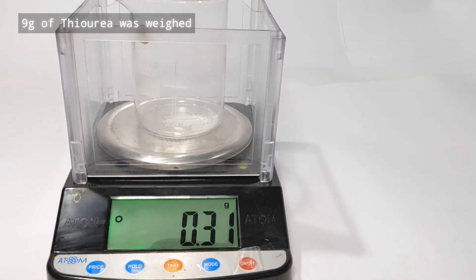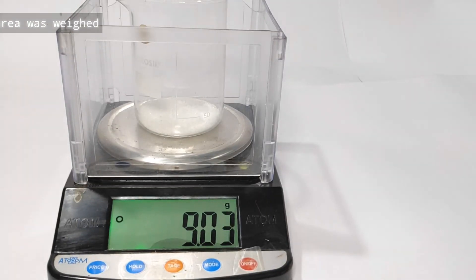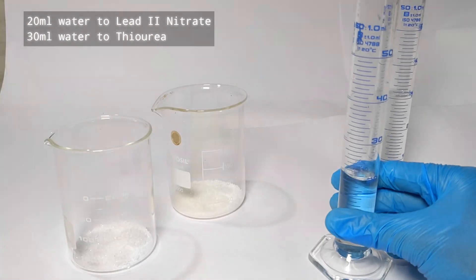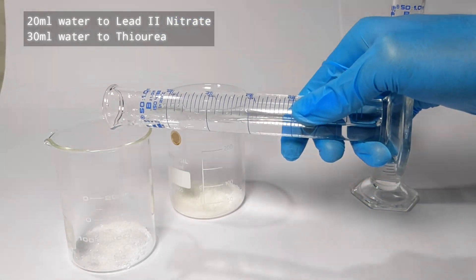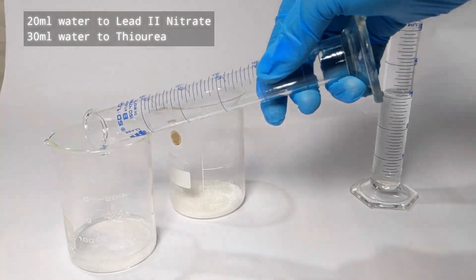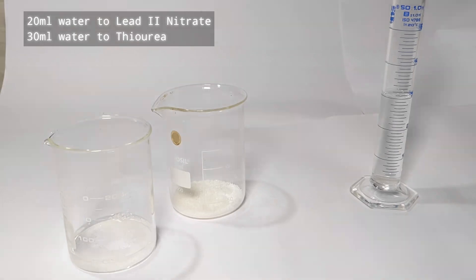Next, 9 g of thiourea was weighed out in another 250 ml beaker. Now 20 ml of distilled water was added to the lead(II) nitrate and 30 ml of distilled water to the thiourea.